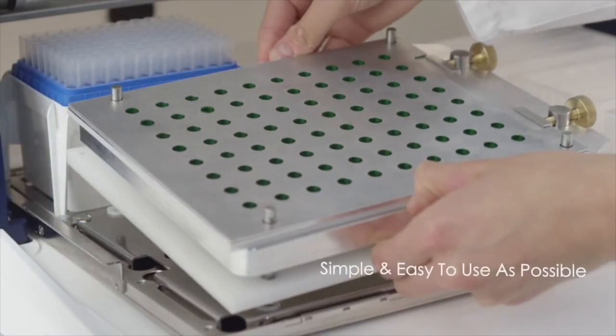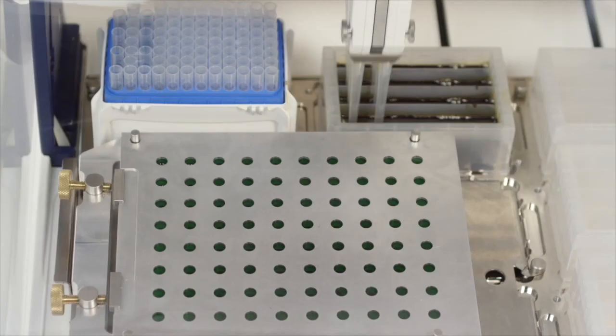We've designed the Robo LQ to be as simple and easy to use as possible, while still giving you complete control of your capsule filling operation.